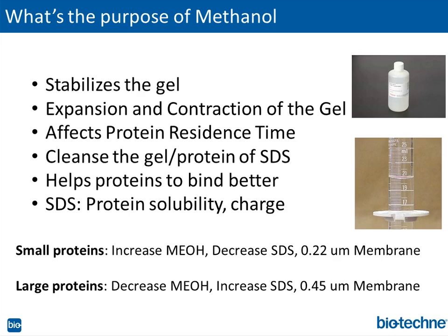But what do you do with large proteins? You lower the methanol to, say, 10%. Why? Because the problem with large proteins, as we had mentioned, is they get trapped in the gel because they're sterically hindered. They're just so large. I'm talking a 450 kilodalton protein.